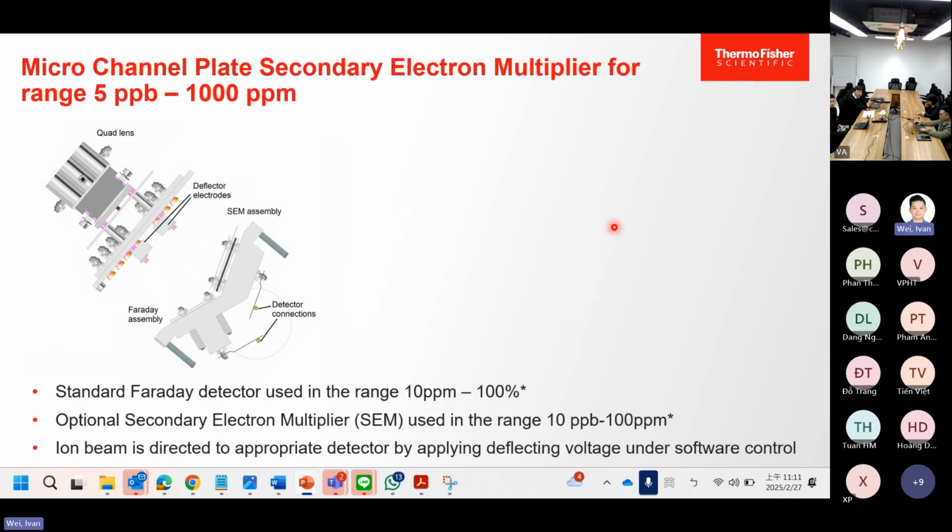Okay, there is another detector that is used for Sentinels. Sentinels tend to be used for occupational health and safety. The range can go from ppb levels to ppm levels. Of course, since the magnetic mechanism is a little bit different, the way we do the detection and the detection limit will be different.